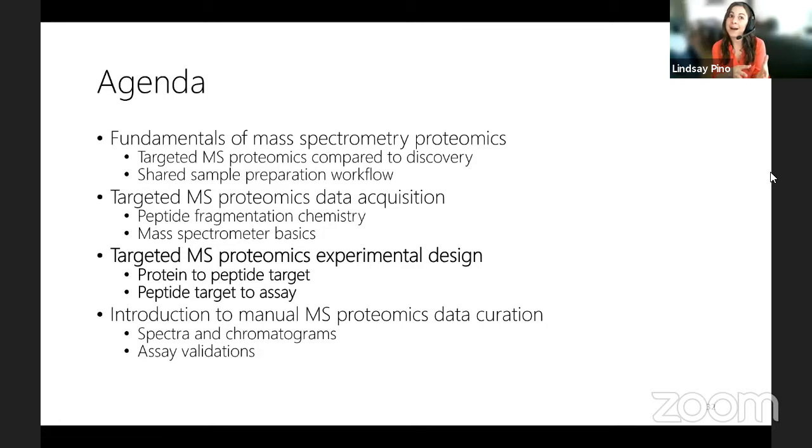That's in comparison to a precursor spectra, where you just put all of the precursors in the mass to charge measurement. So you didn't break up the precursors. You can see all of the precursors in an MS1 spectra. I hope that answered that question. I think we got that one.